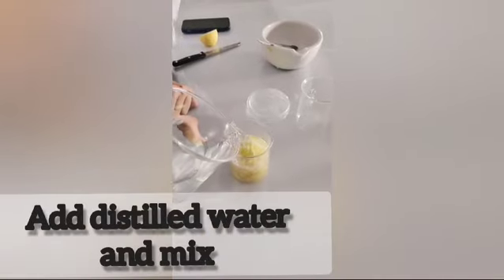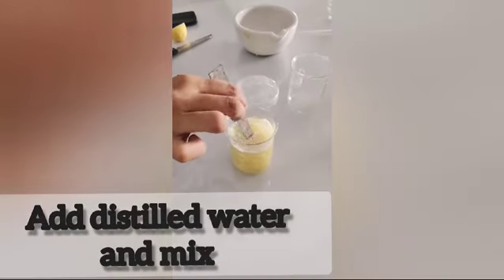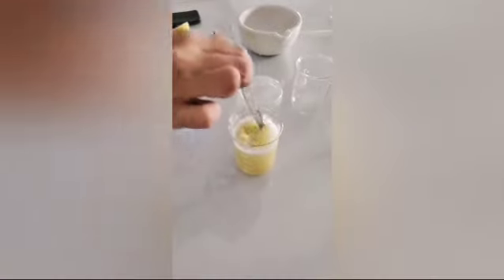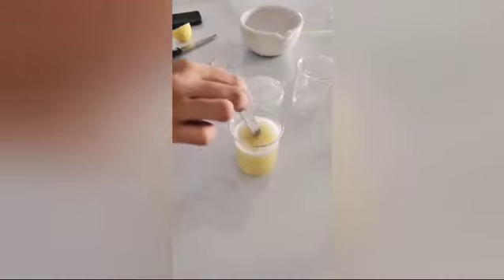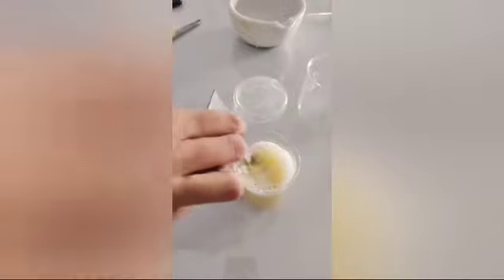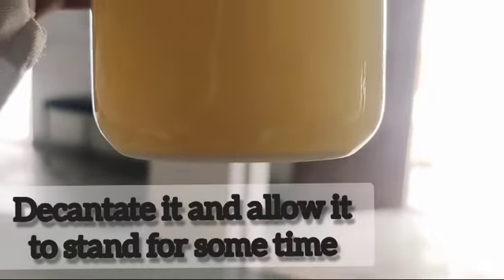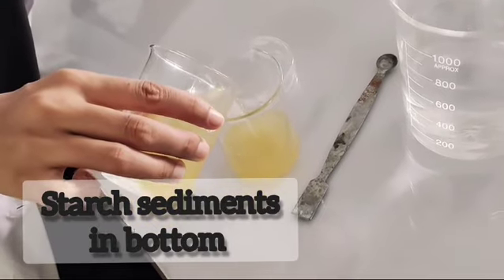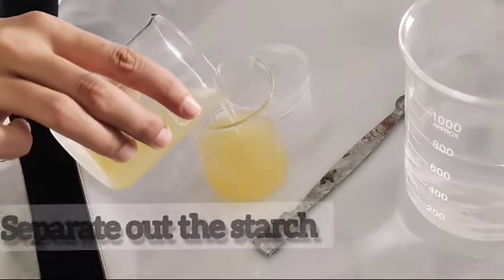Now, add distilled water to the potato and mix it. Decant it and allow it to stand for some time. The starch sediment settles at the bottom. Remove the liquid to obtain the starch.